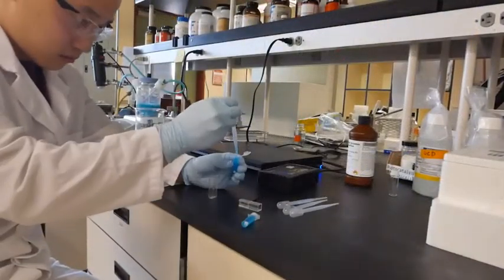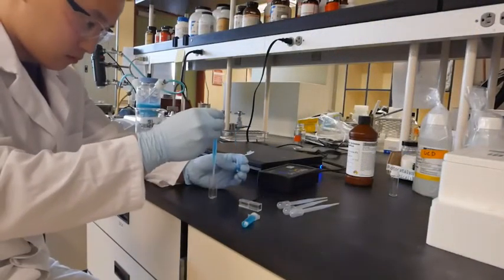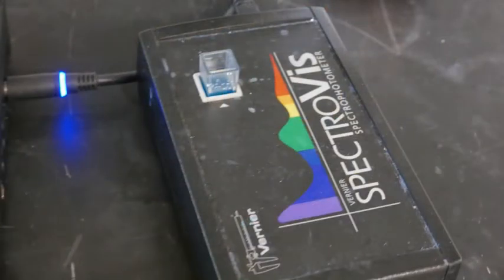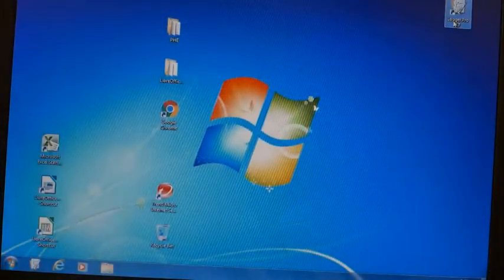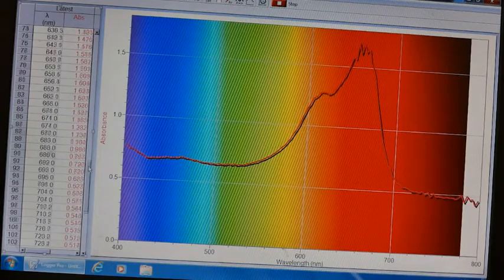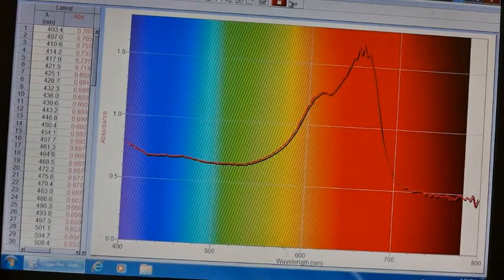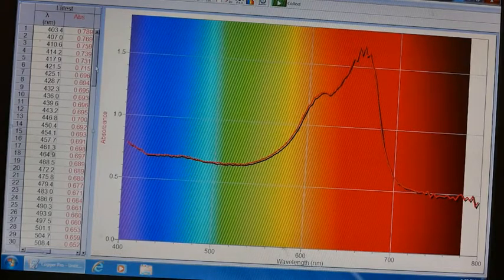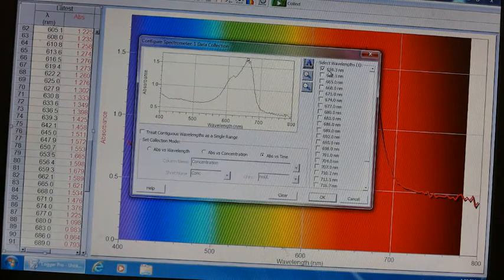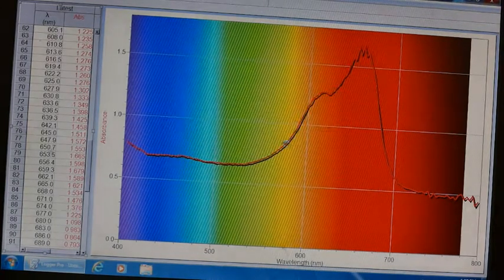Use a pipette to transfer the supernatant and place it into a cuvette. You may need the supernatant from both centrifuge tubes to fill one cuvette. Place the cuvette inside the spectrophotometer. Make sure that the cuvette solution level is at or above the white rim so that it is properly read. Open up the software and click collect. Look for the wavelength with the highest absorbance value — you will want to collect data using only that wavelength. Stop collecting data and click configure spectrometer. Set the collection mode to absorbance versus time and collect data on the wavelength with the highest absorbance value.